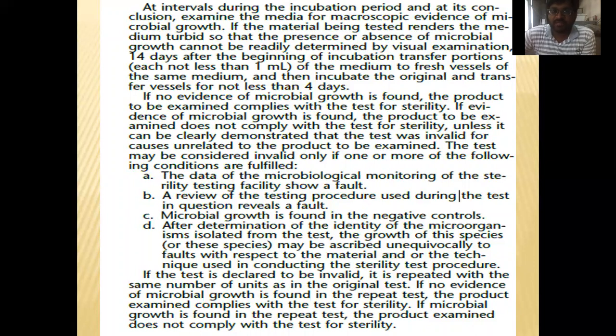So 14 days after the beginning of the incubation, transfer portions of not less than 1 ml of the medium to fresh vessels of the same medium, and then incubate the original and the fresh vessels for not less than 4 days. If no evidence of microbial growth is found, the product examined complies with the test for sterility. If evidence of microbial growth is found, the product examined does not comply with the test for sterility, unless it can be clearly demonstrated that the test was invalid for causes unrelated to the product examined.